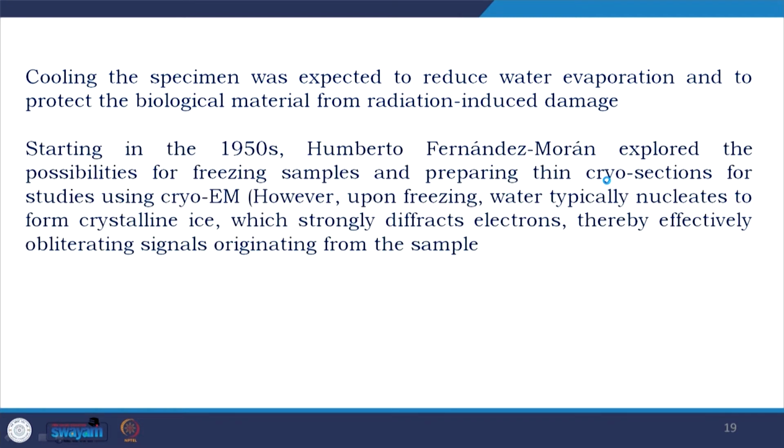Now, starting in the 1950s, Humberto Fernandez-Moran explored the possibilities for freezing samples and preparing thin cryo sections for study using cryo-EM. However, upon freezing, water typically nucleates to form crystalline ice, which strongly diffracts electrons, thereby effectively obliterating the signal which originates from the sample.